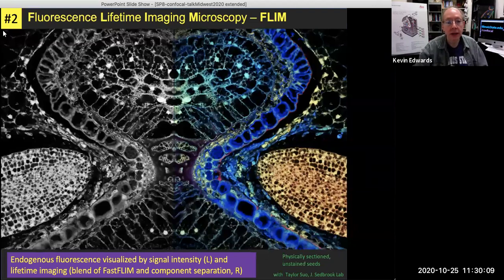All right, so for our next imaging mode, we're going to talk about FLIM. That's Fluorescence Lifetime Imaging. I'm just going to give you a quick overview, give you a sense of what's going on there.